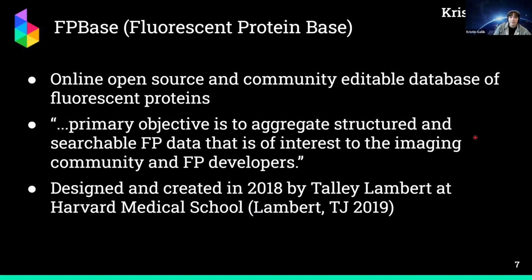Fluorescent Protein Base, or FP Base, is an online open source community editable data set of fluorescent proteins. Their primary objectives are to help aggregate structured and searchable fluorescent protein data that is of interest to the imaging community and fluorescent protein developers. It was developed and designed by this single guy, Talley Lambert, at Harvard Medical School back in 2018. And honestly, this website has really flourished since then. It's a really great resource.